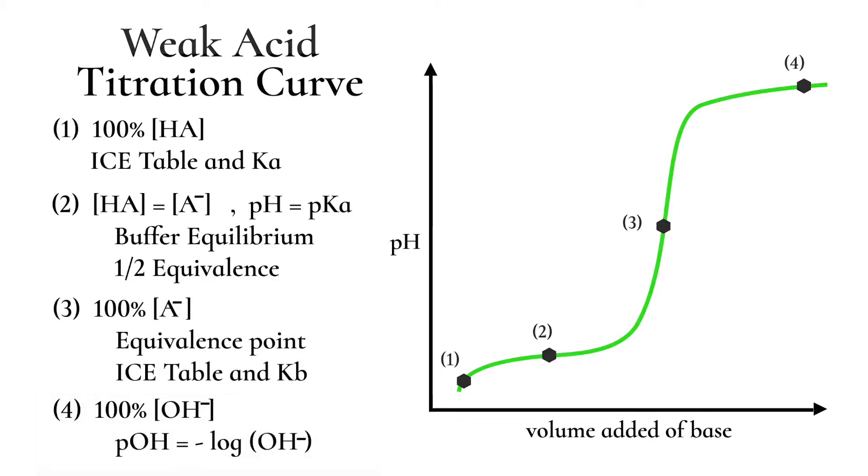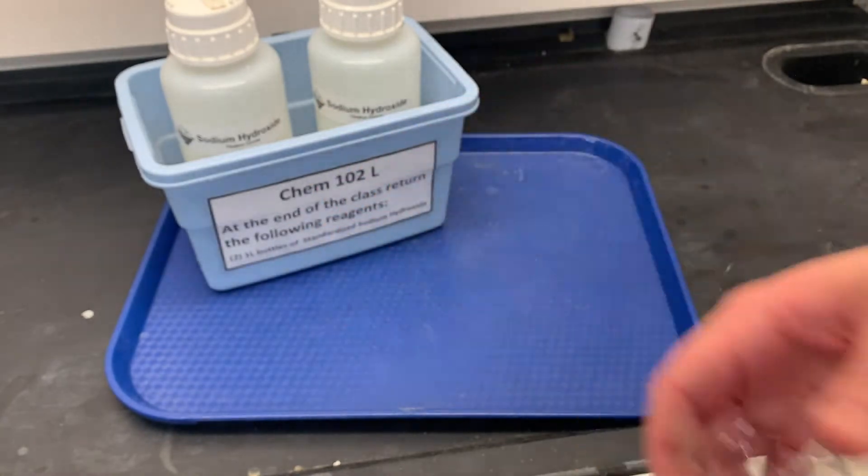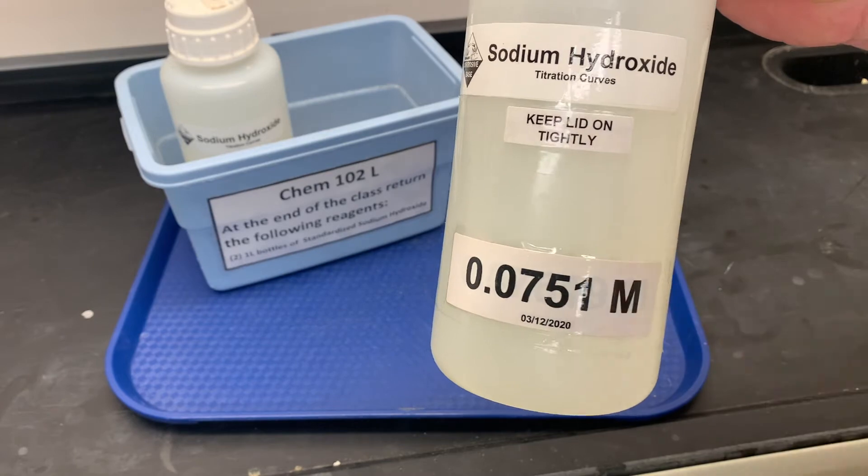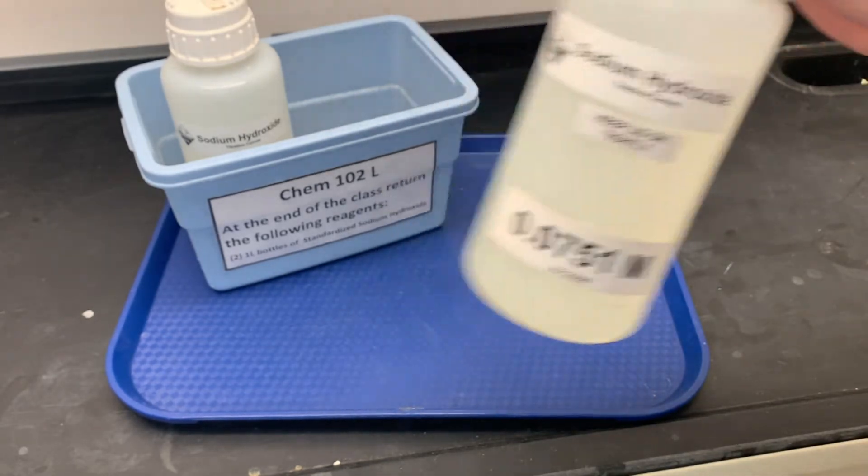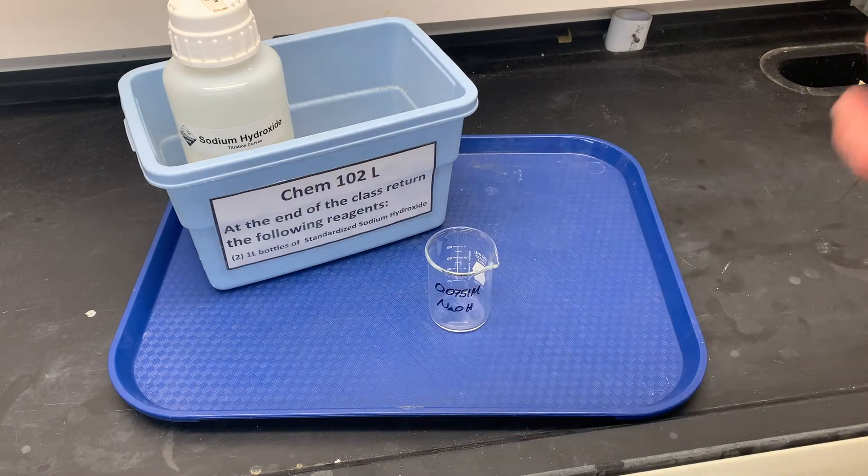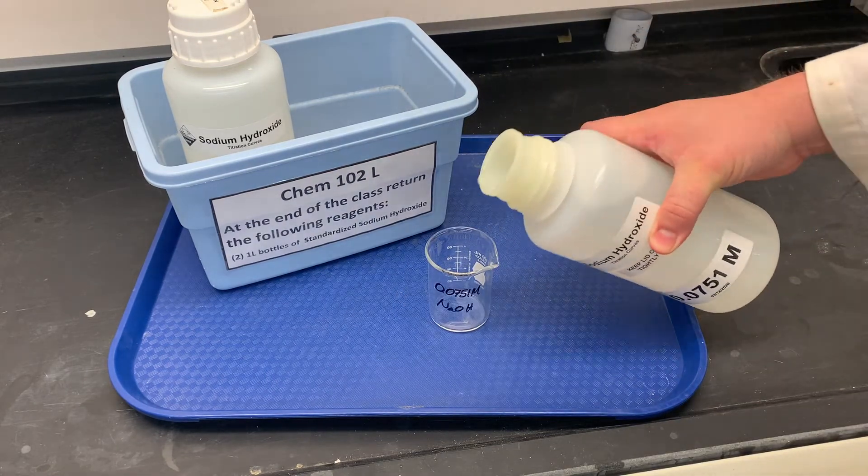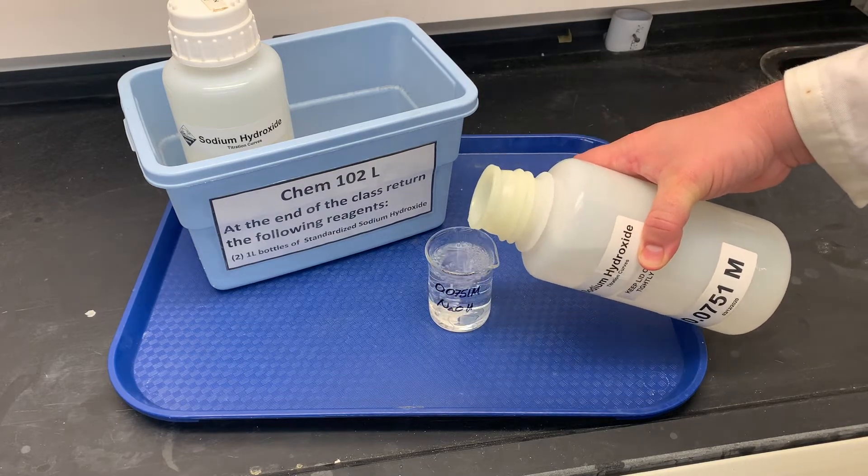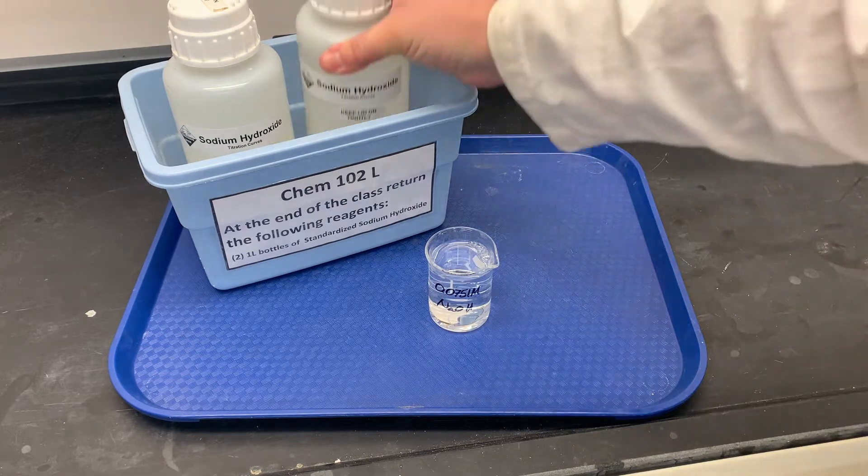Okay, we're going to start by getting our reagents together. First, we're going to need our sodium hydroxide. Now, today's is this concentration. Yours may be a little different. Make sure you write down whatever the concentration is given. In this case, we're going to have to do three titrations. So I'll need about 75 plus a little bit more for a rinse. So I'll take about 100, just a little bit less.